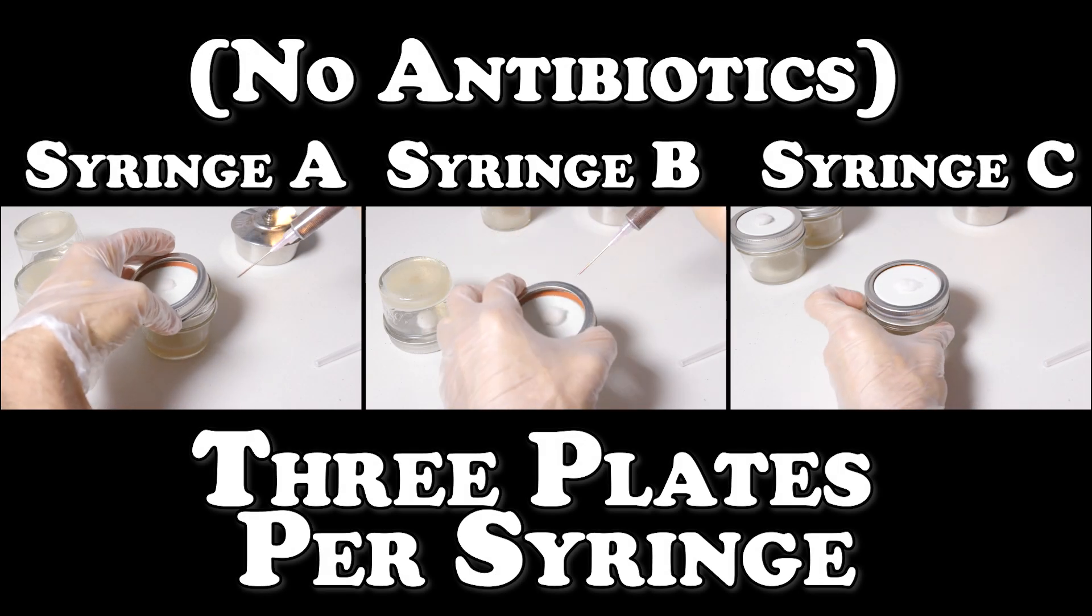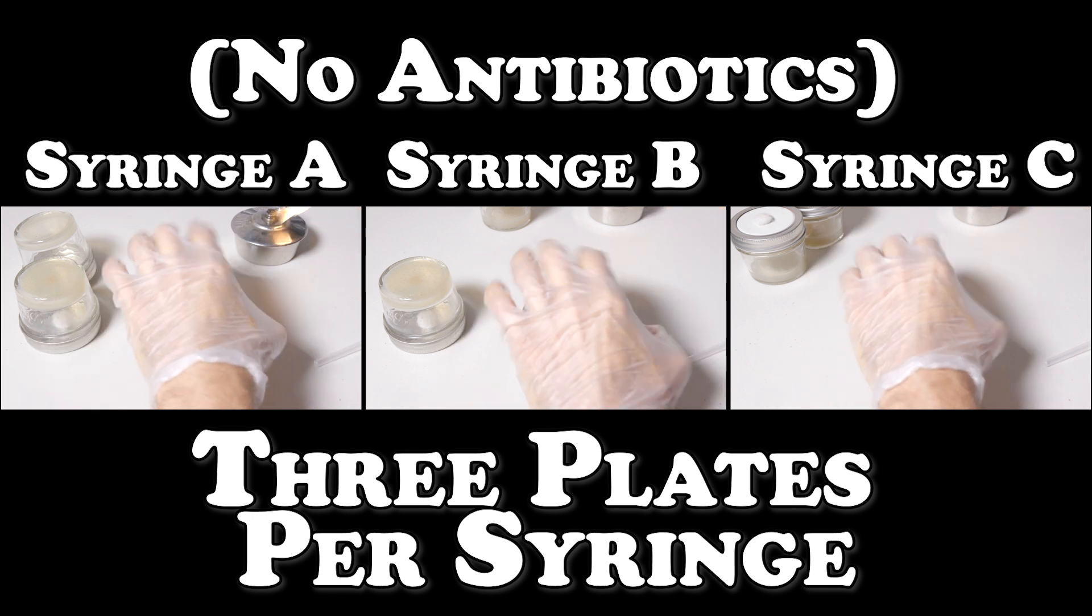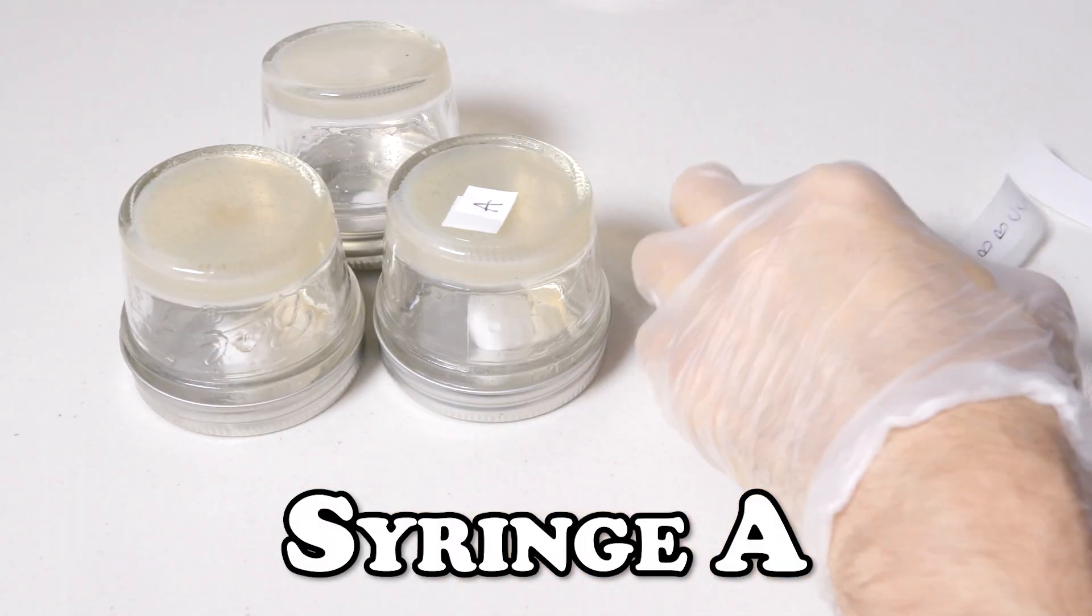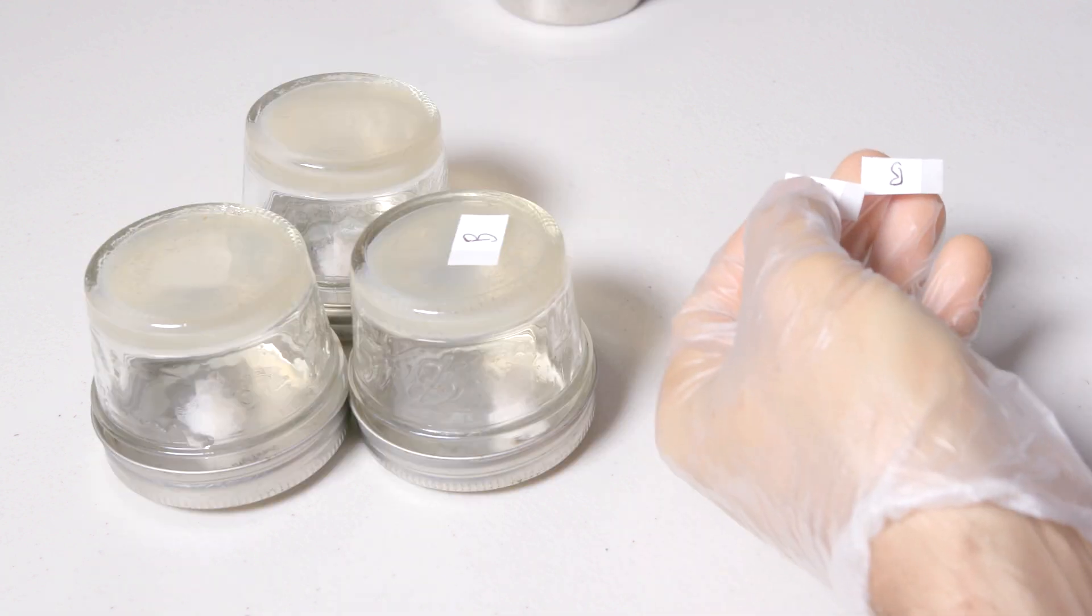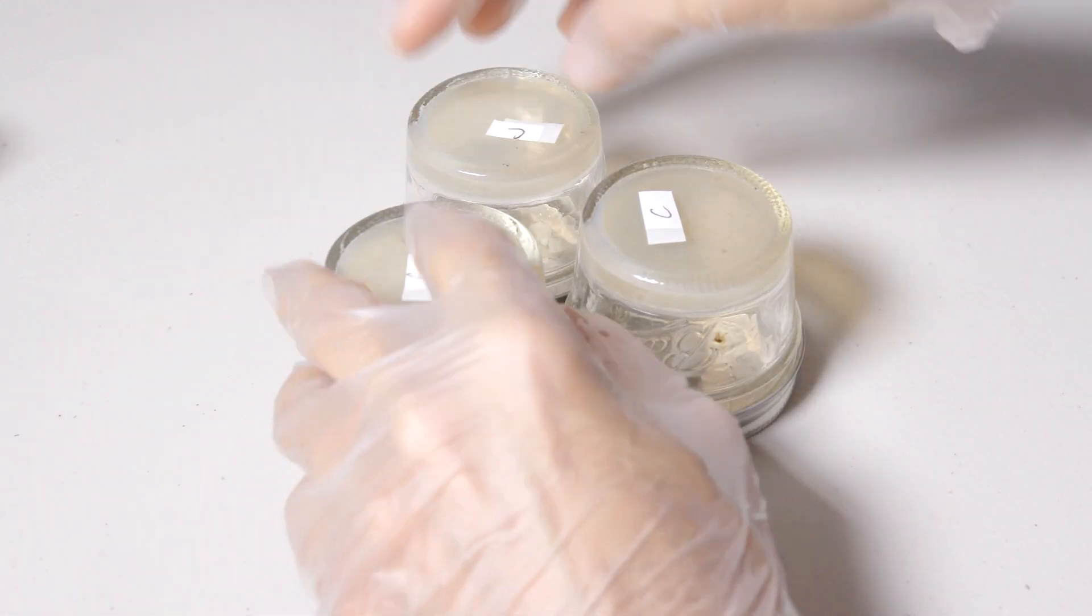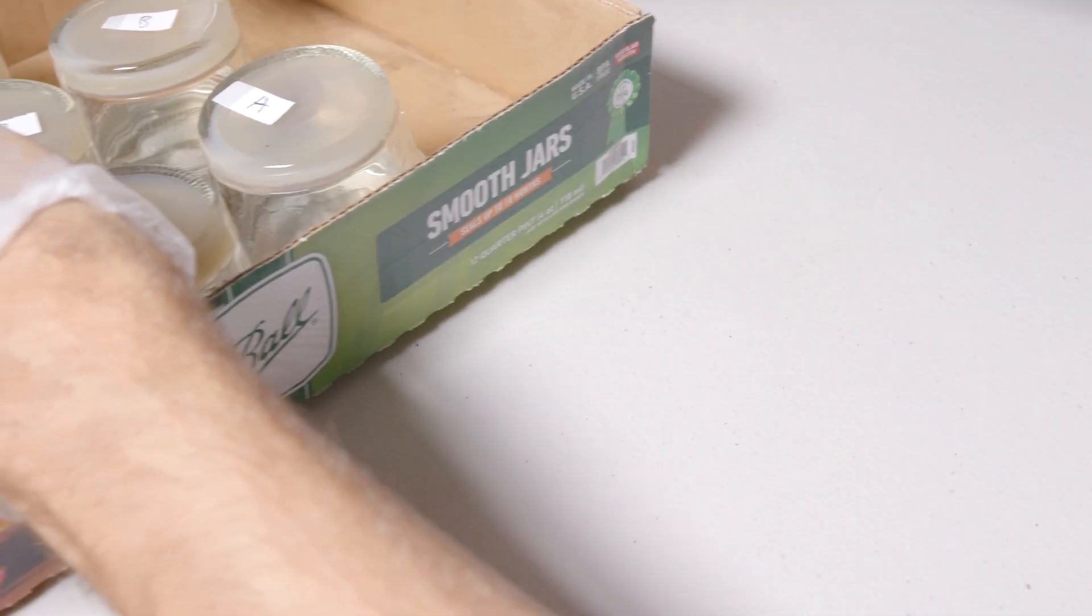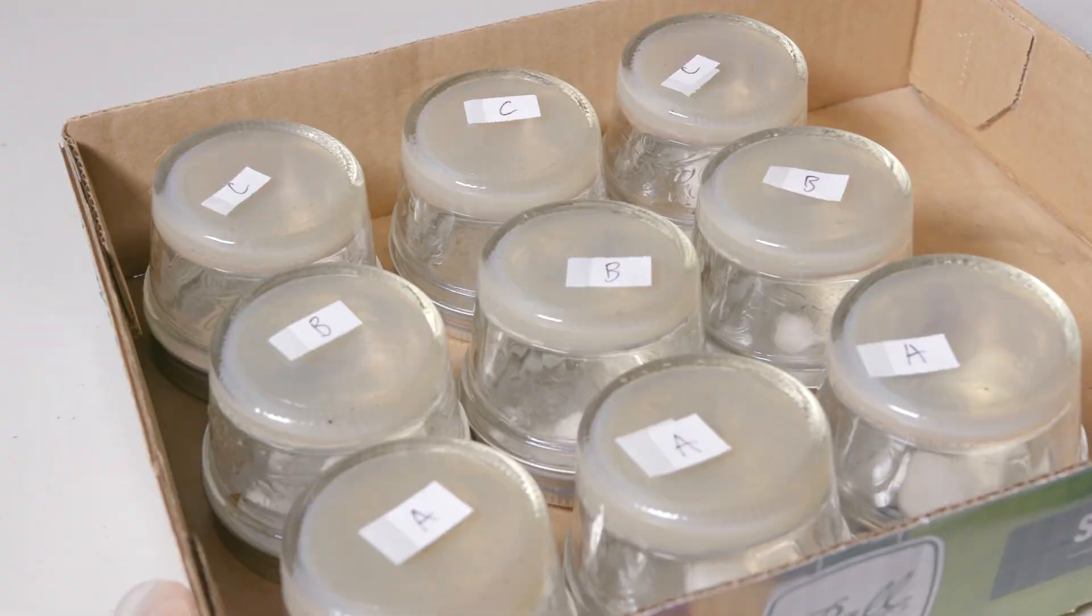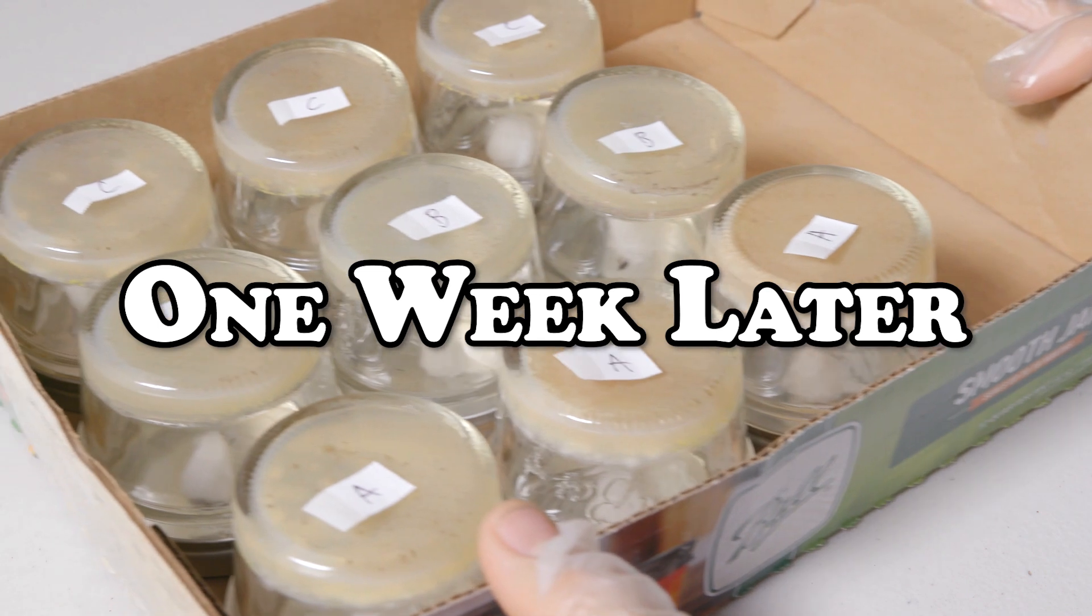Syringe A, B, and C will each inoculate three plates per syringe. Here we are adding the spores onto our regular plates - no antibiotics - and we're going to set them aside for one week and have a look at them. For the first inoculation I like to simply add the syringe strain I'm working with to each plate, so here we just have A, B, and C. Once I get to the first round of isolation I'll then start adding numbers to each plate to keep track of the subsequent rounds of isolation. Here we are ready with our plates one week later.